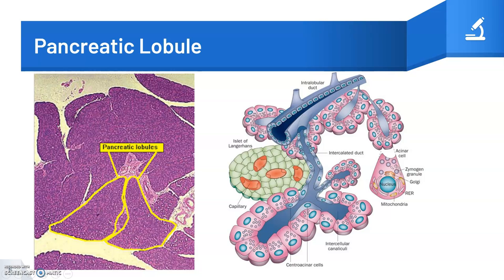Acinar cells have peripherally located nuclei and abundant granular cytoplasm. They secrete a variety of active enzymes and inactive proenzymes into the acinar lumen. These secretion products are carried from the acinus to the duodenum via the ductal system. Proenzymes are then converted to active enzymes in the duodenum.